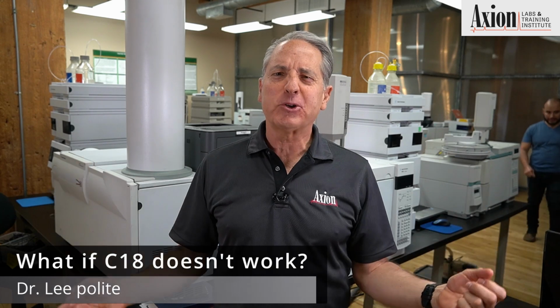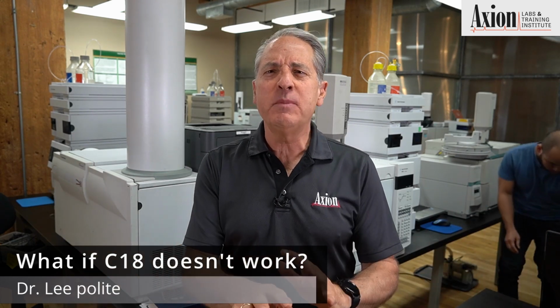We've got a great talk that I put together, and it's really what I would call step 2 in method development. Like, what if C18 does not work? So I want to take you through a little bit of, remind you of method development, and then really get you into thinking about alternative columns.